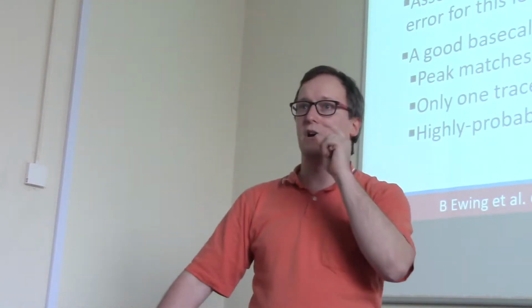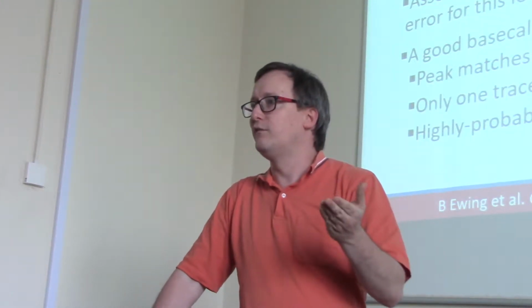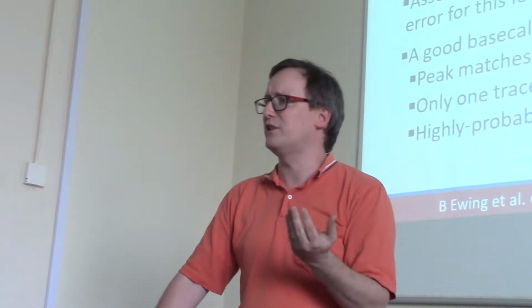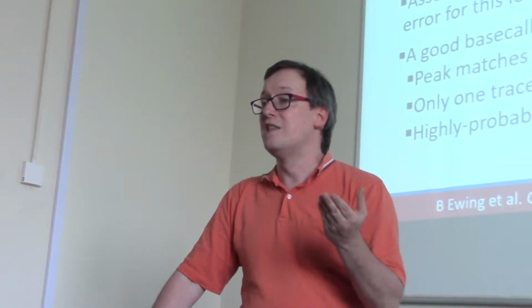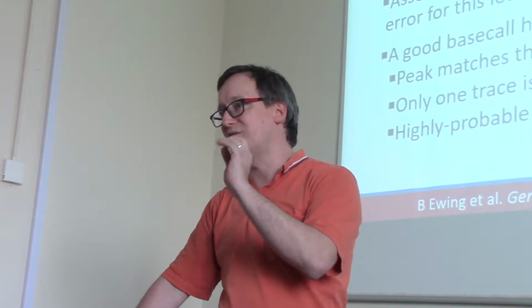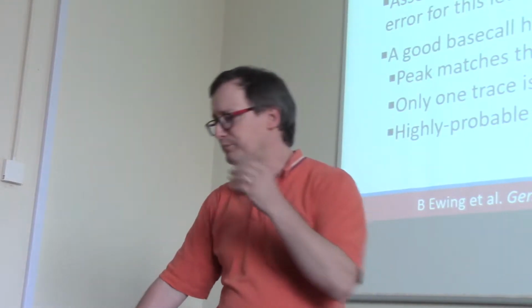Now, you might ask, why do we keep calling them Phred scores if we're no longer using Phred for computing them? After all, we're in the realm of high-throughput sequencers now, massively parallel sequencers. So why are we still calling them Phred scores? And the answer is that the way that Phred computes its scores has been adapted to apply to the newest sequencers, and the way it expresses errors is a very good universal model, really, for talking about error.